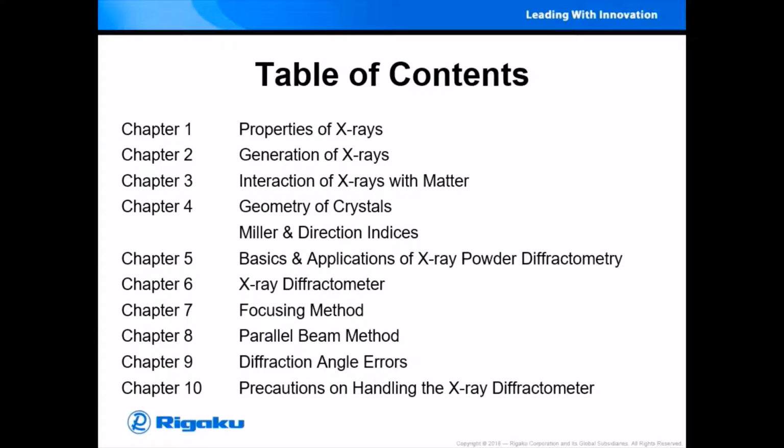This is a 10-part series of fundamentals of X-ray diffraction. At the beginning, I would like to show the contents of each part. In Chapter 1, the properties of X-rays are explained.